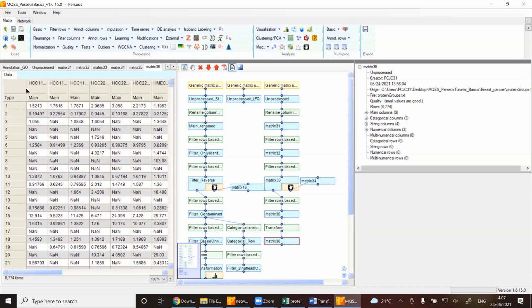Of course, you cannot test this manually for all the rows, but you can trust Perseus that it did the right thing. So we do now a second transformation, and as I told you already, the log2 transformation is the default one. And why is this the case? So now we have those ratios, and of course, if nothing has changed, the ratio is 1. If something has heavily changed towards the light side, basically, you have a ratio of, I don't know, 50 or maybe even 100.